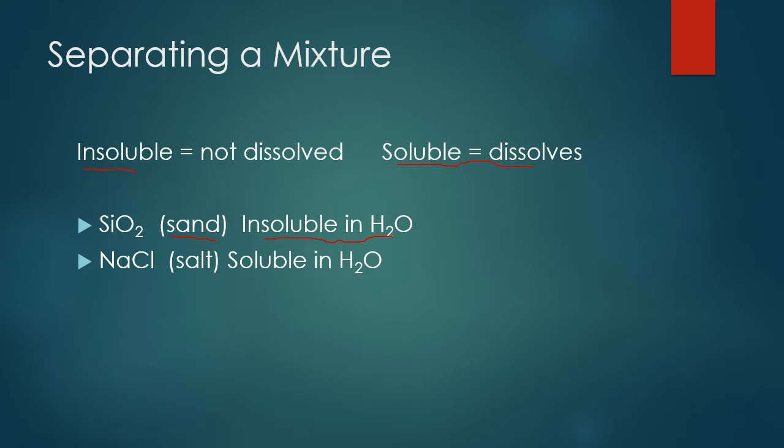Now looking at sodium chloride, the other component of the mixture. Sodium chloride, also known as table salt, is soluble in water. If we were to add water to table salt, we would see it dissolve. Hence the saltwater ocean at the beach.